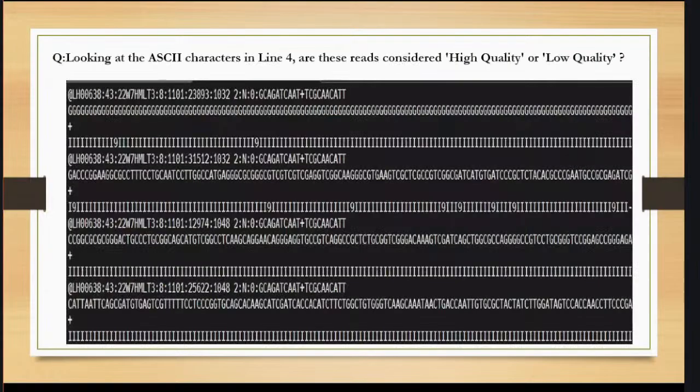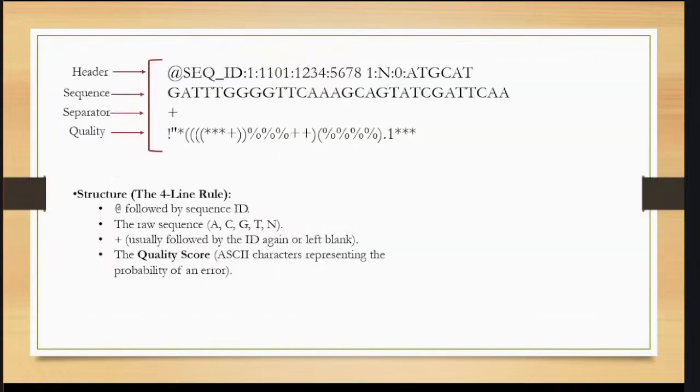I told you 2 things here, that there is a header and the record has 4 lines. I'm giving you a hint that there is a format where there are 4 lines. Can you think of it? Because FASTA has multiple sequence lines, but FASTQ has only 4 lines.